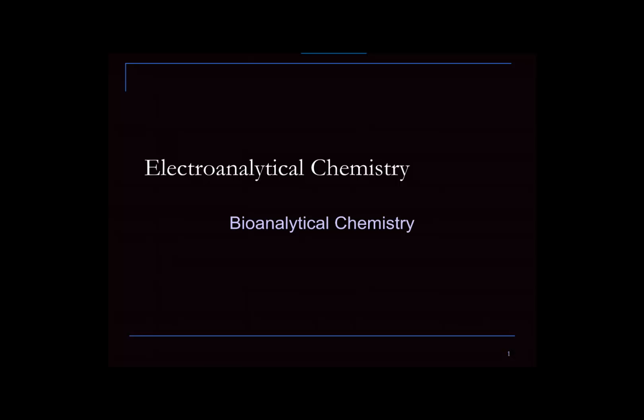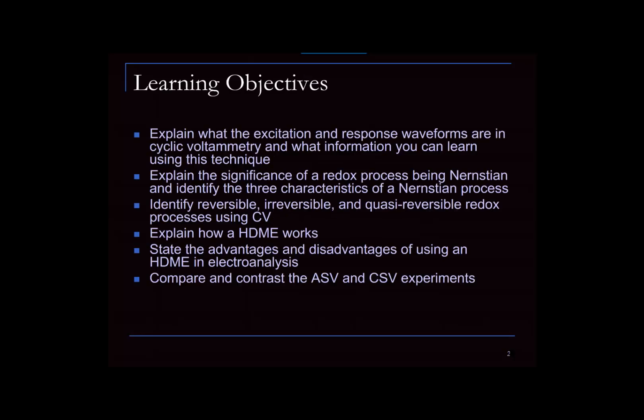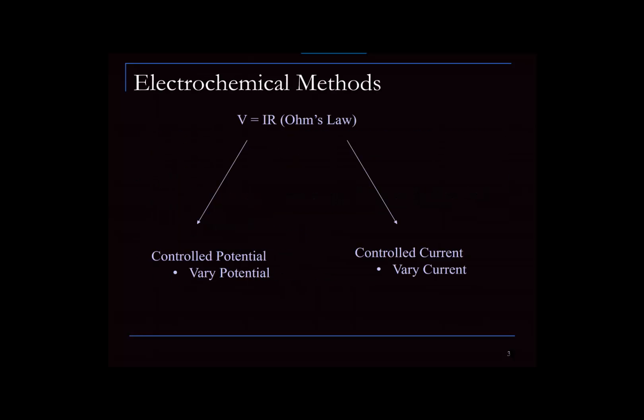to this second podcast on electroanalytical chemistry. And in this podcast, we're going to focus on a discussion of cyclic voltammetry. I will then stop the podcast, and there'll be a third podcast that will focus on discussion of the hanging dropping mercury electrode and on its use in stripping voltammetry.